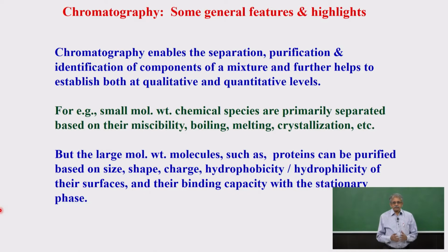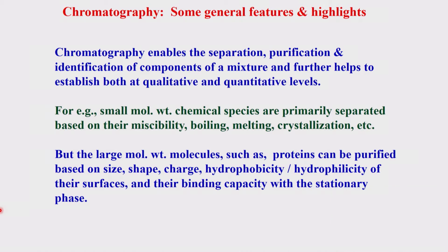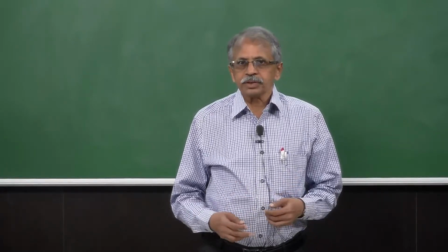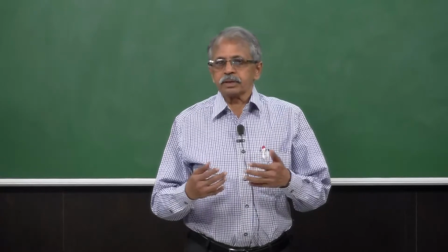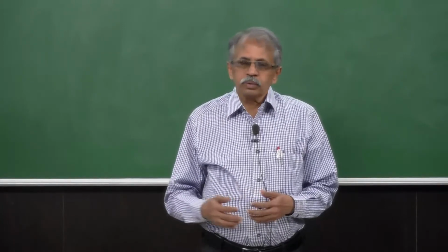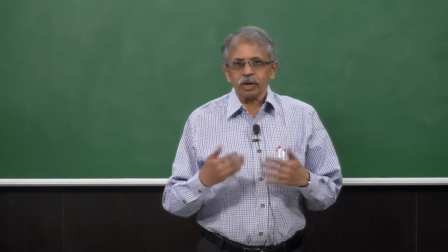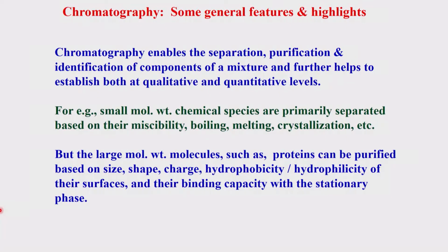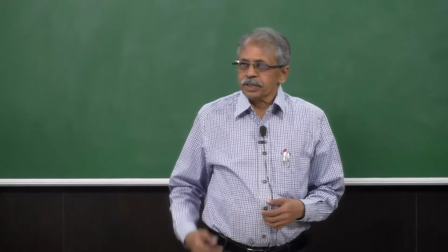If you look at simple chemical molecules, the separations are basically based on their nature, in terms of their solubility, their melting points, their boiling points, their crystallizations, and many of these aspects. If you were to move to the high molecular weight or biomolecular species, like proteins and nucleic acids, these parameters, the melting, the crystallization, the boiling, the miscibility, the solubility, are not going to be the issues. The parameters which determine the separation are quite different.